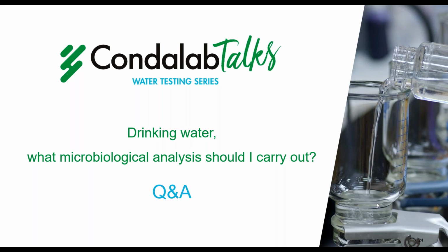What alternative methods exist for water analysis? The most effective method, of course, is chromogenic media, which is our Condachrome line. That is being gradually introduced in ISOs. In reality, it is very difficult for other methods to exist, because the disinfection of water, of course, can have an effect on the viability of the microorganisms present.